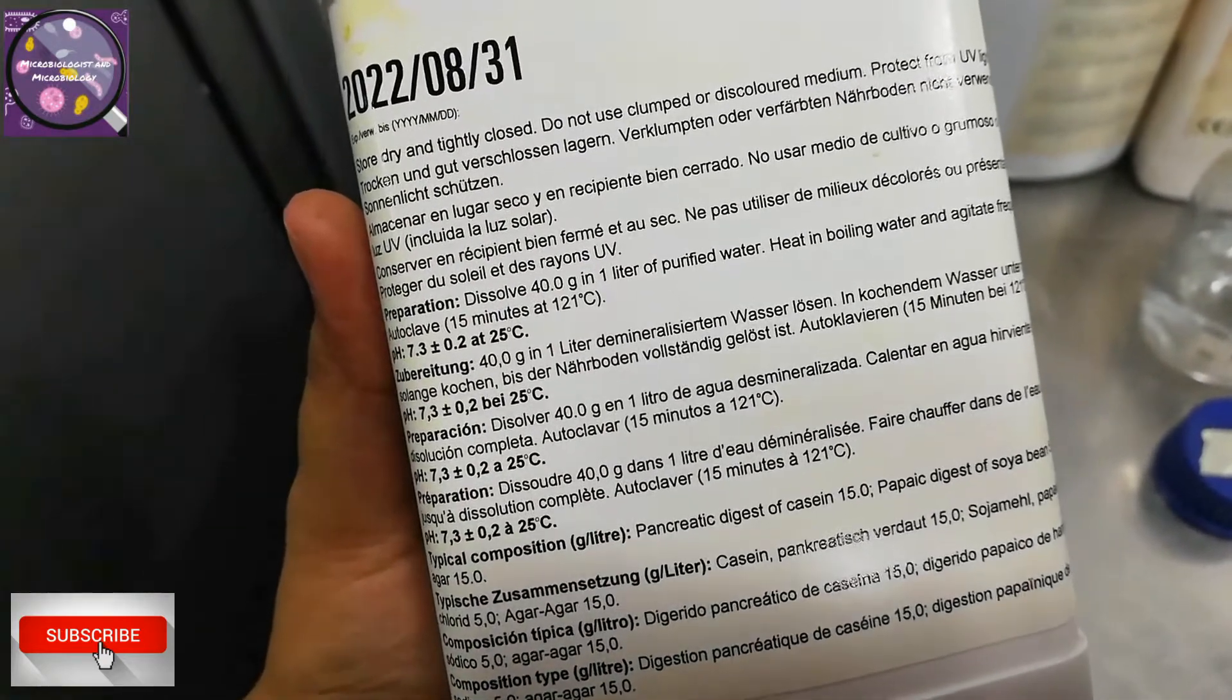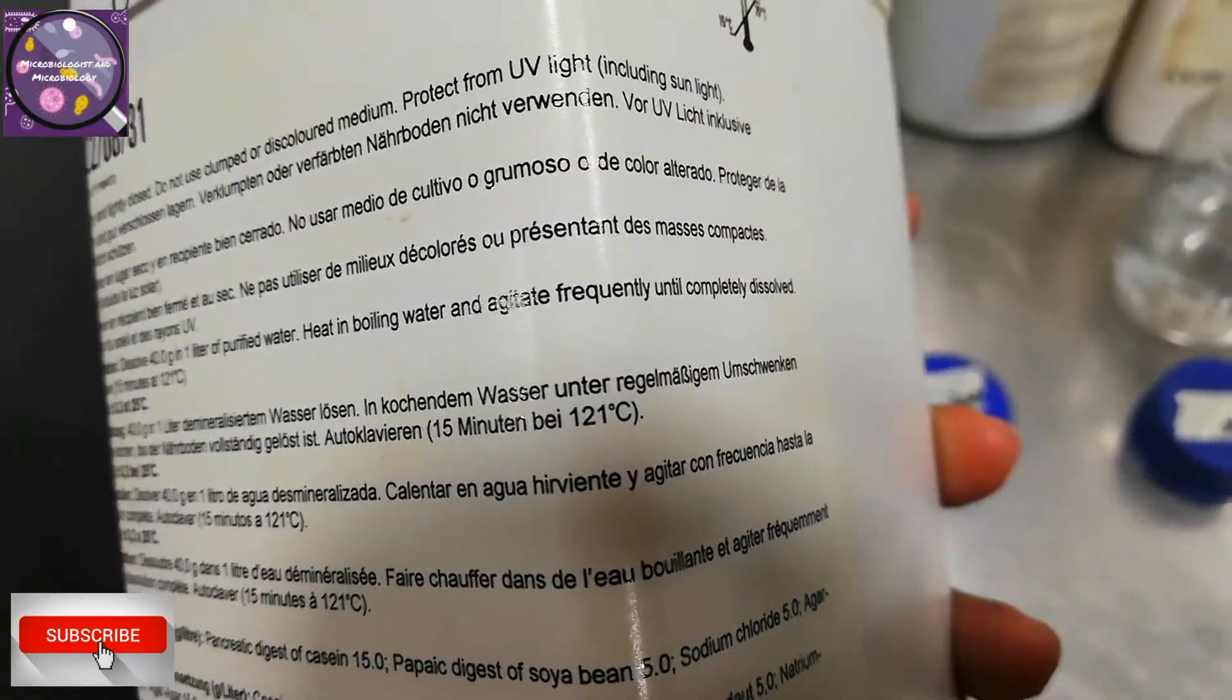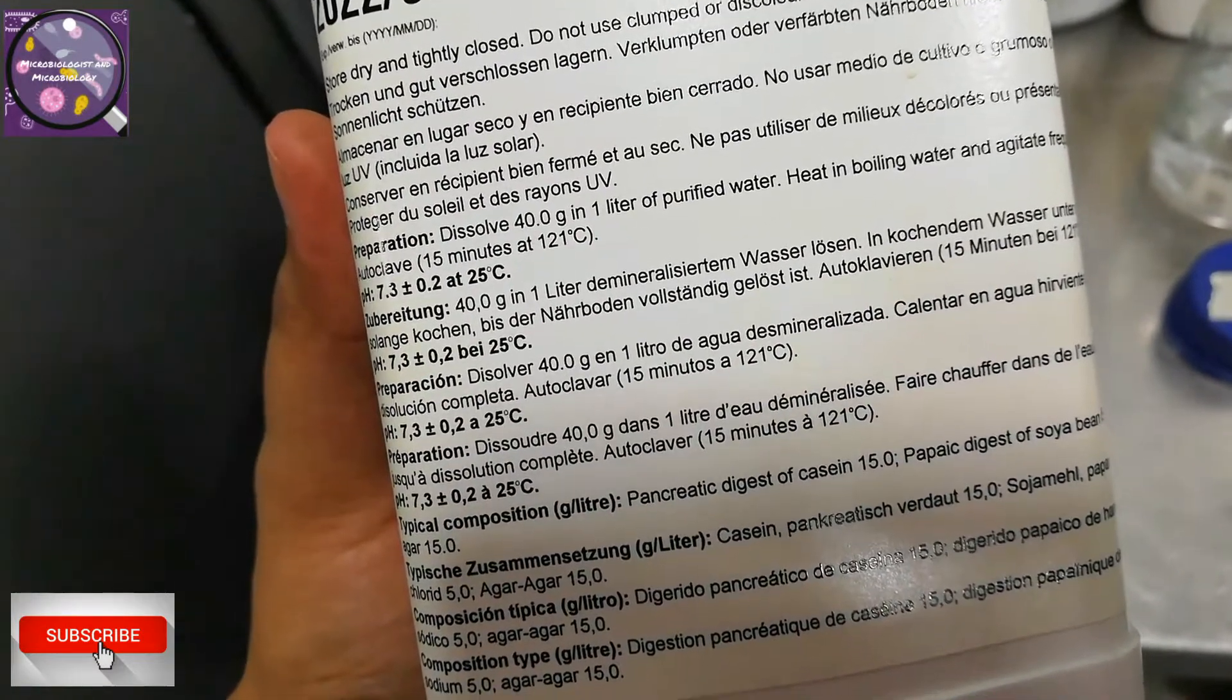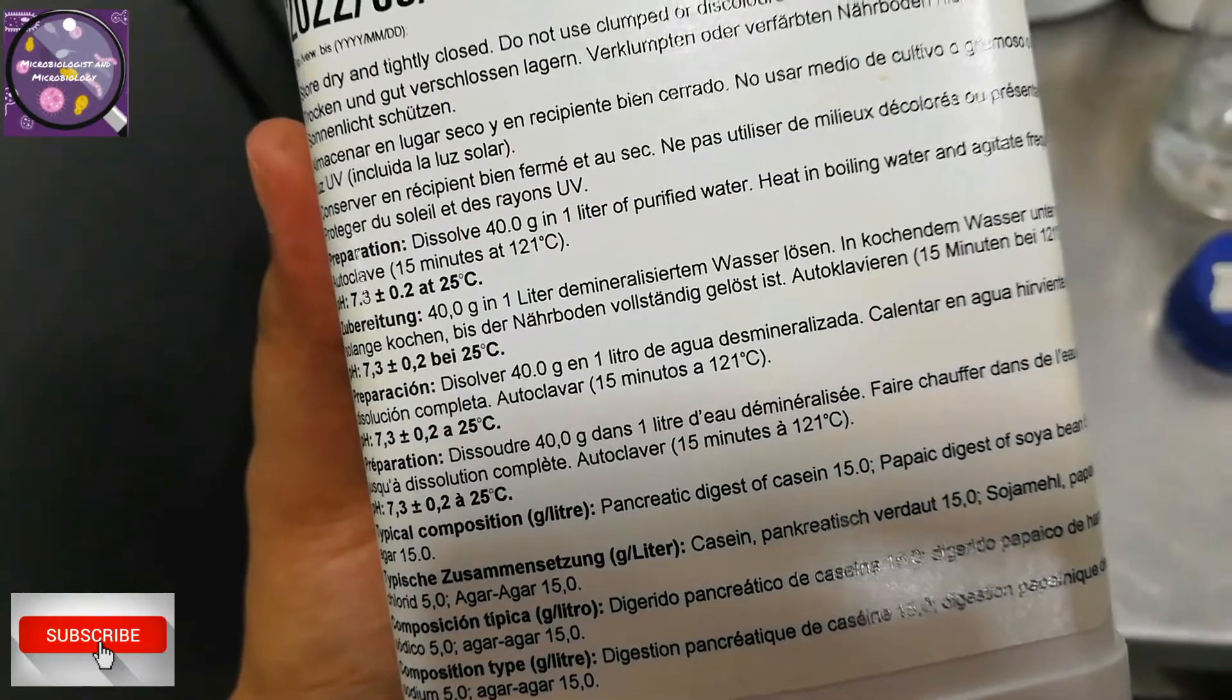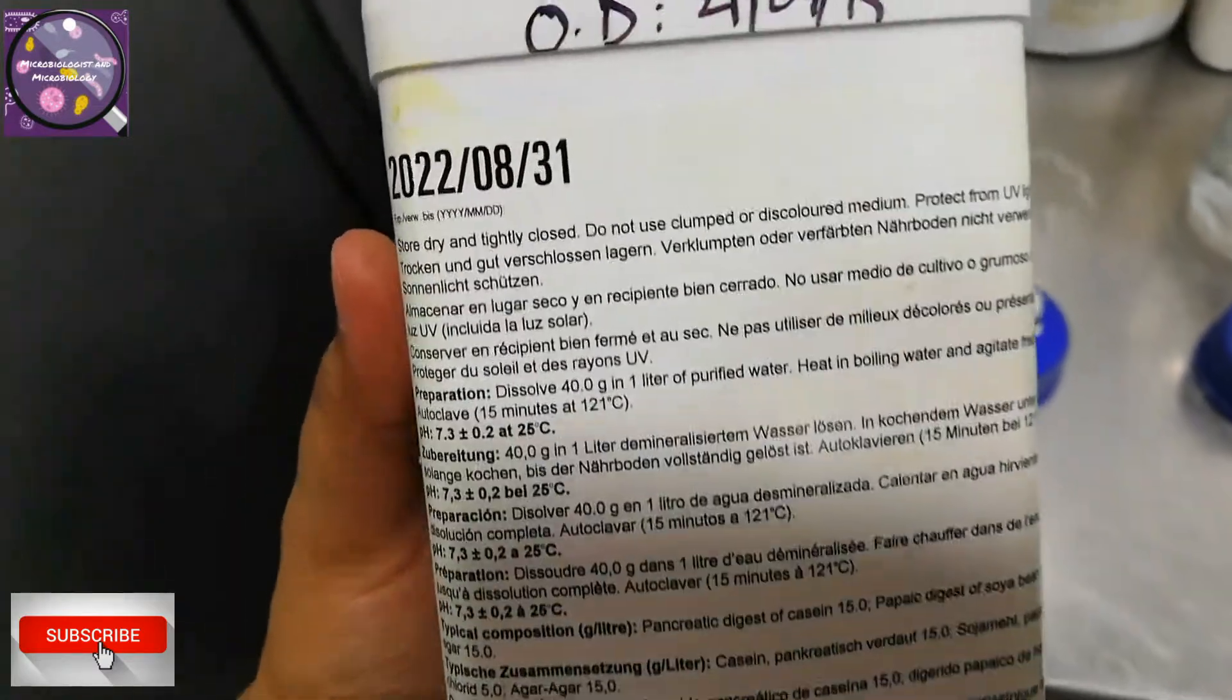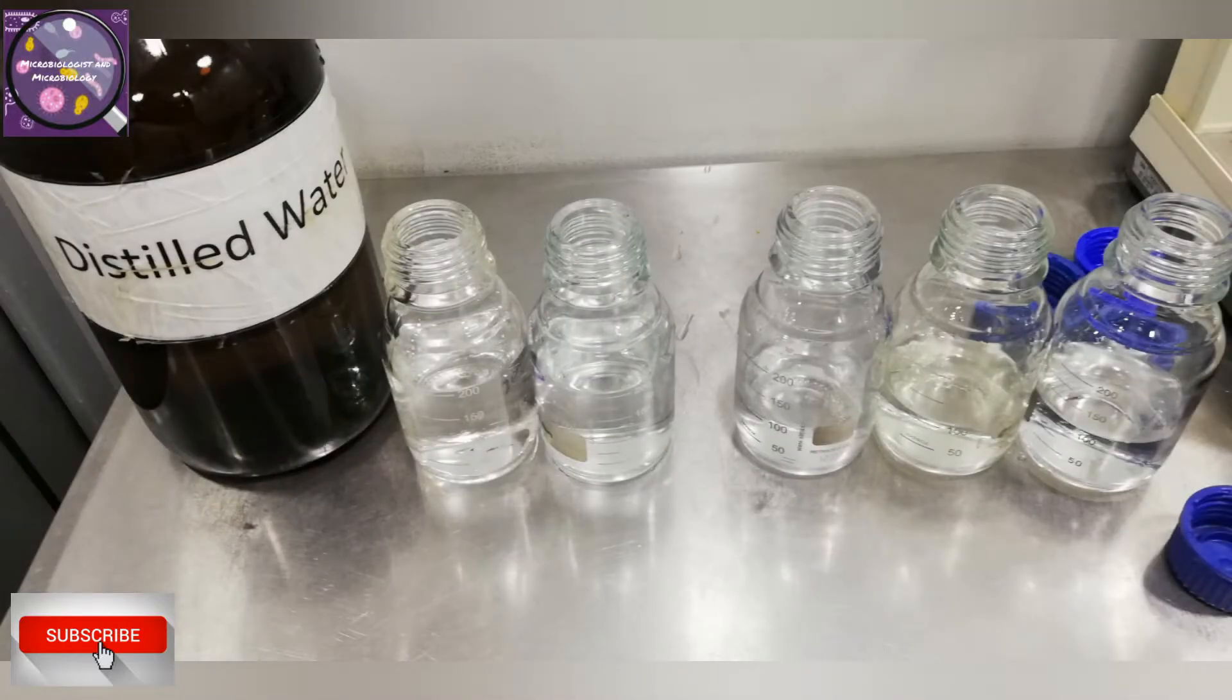Here I will follow the procedure and weigh accordingly. This is a tryptic soy agar bottle and on the back side you can see clearly the procedure and description. It is written as: Dissolve 40 grams in 1 liter of purified water, heat in boiling water and agitate frequently until completely dissolved, then autoclave for 15 minutes at 121 degrees centigrade. I need 200ml of tryptic soy agar media, so I divide 40 grams by 1000ml and multiply by 200ml of required amount. So it will come to 8 grams. Now I am going to weigh 8 grams to dissolve in 200ml purified water.